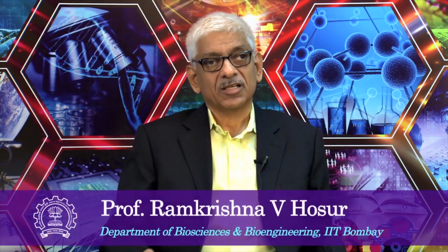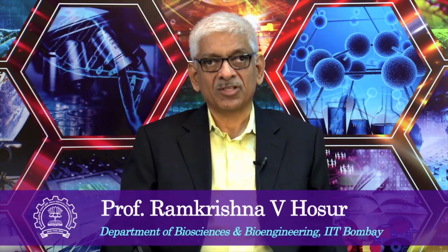So let us do a quick recap of what we did last time. We have been discussing two-dimensional correlation experiments. The COSY has been the most fundamental of all of these experiments, which is the first experiment that was done with regard to the homonuclear correlation experiments, and this is very important to understand. We actually went through a detailed analysis of this basic experiment using a 2-spin system, a weakly coupled 2-spin system.